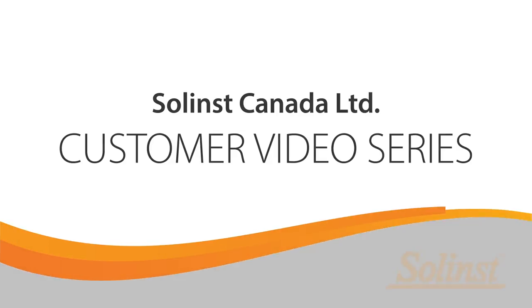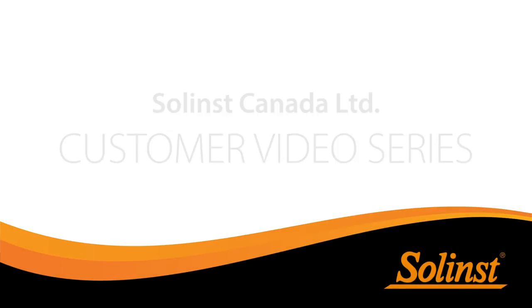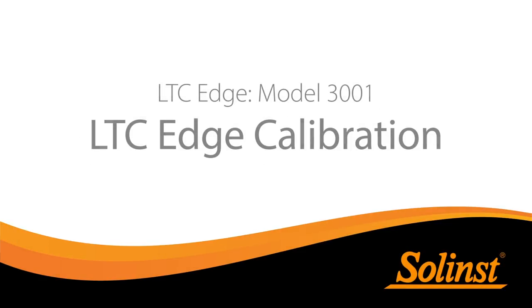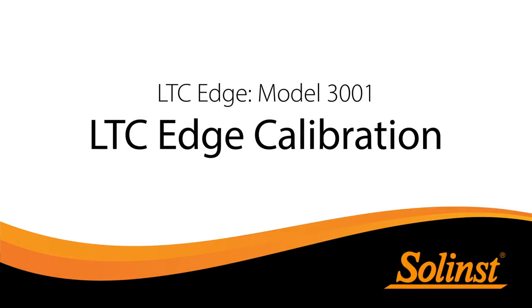Welcome to the Solinst customer video series. In this video, we will conduct a two-point conductivity calibration for the LTC Levelogger Edge.